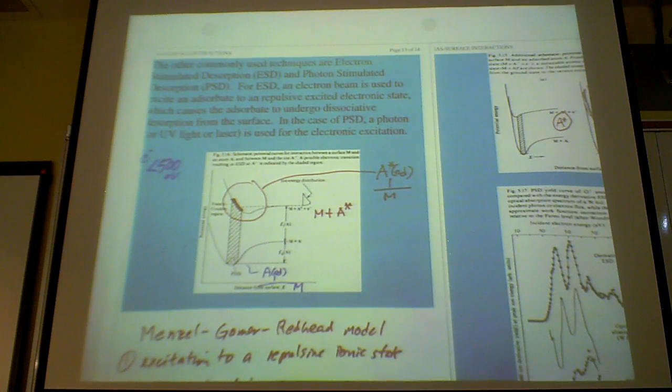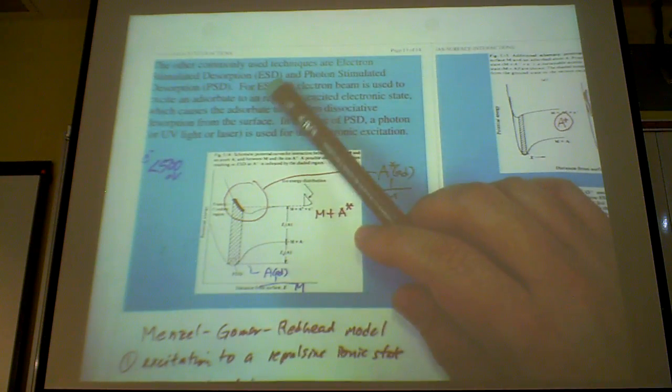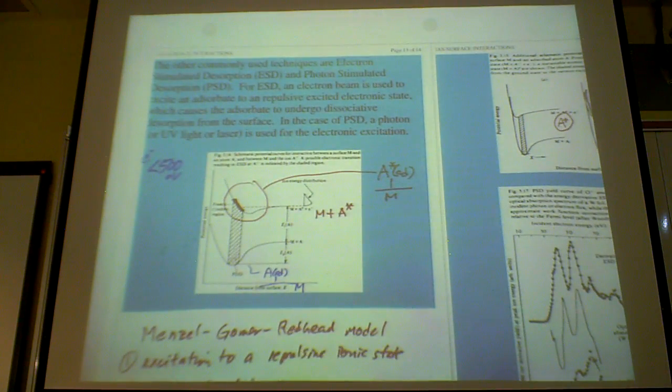In the case of electron excitation, you don't need that because you are just transferring kinetic energy in a continuous way, not a quanta kind of way, to your surface. So it's more flexible with the electron beam. But the difference here is that, of course, the electron beam has momentum. It means that you could have a sputtering effect on the surface, and it could destroy the surface itself.